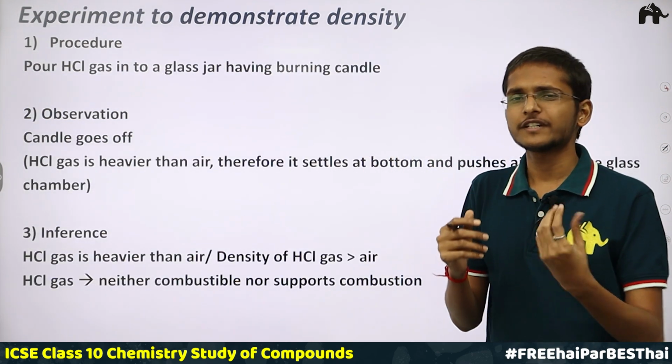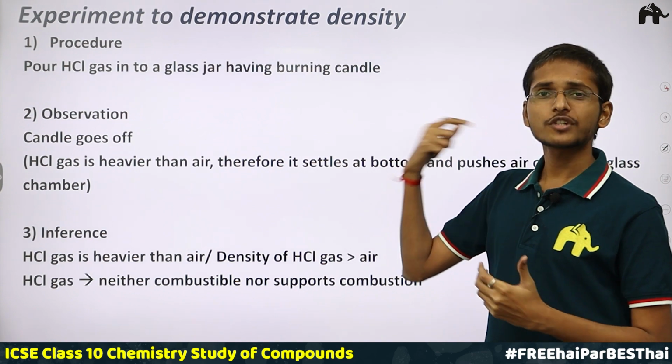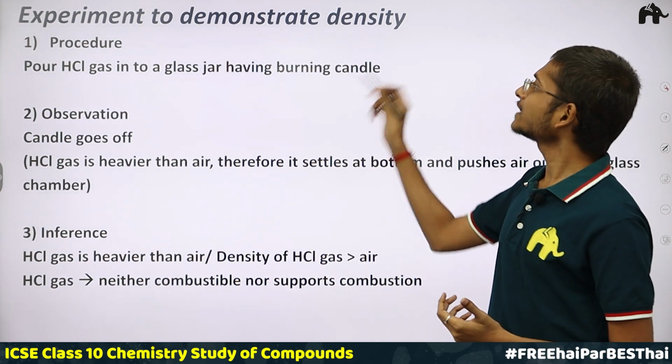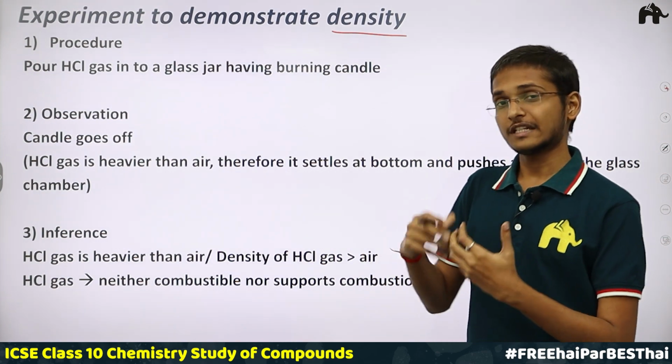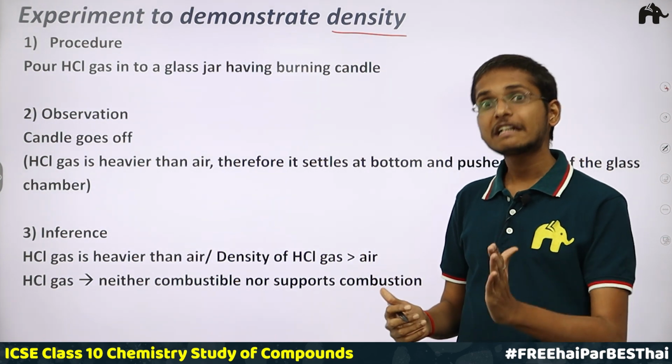This is a very simple topic, very interesting topic. I have told you that we are going to study the experiment to demonstrate the density of hydrogen chloride gas, that the density of hydrogen chloride gas is greater than the air.